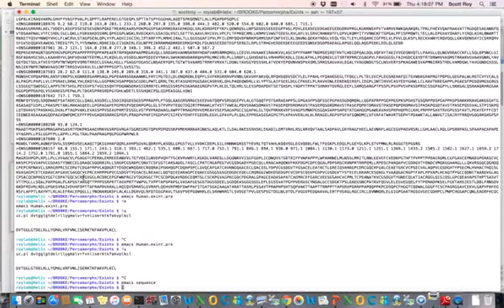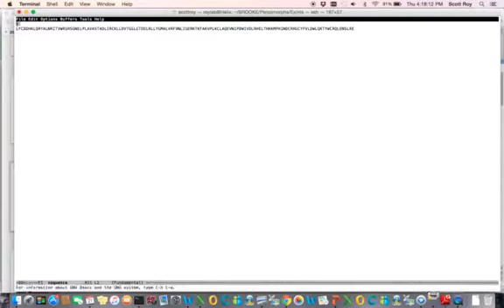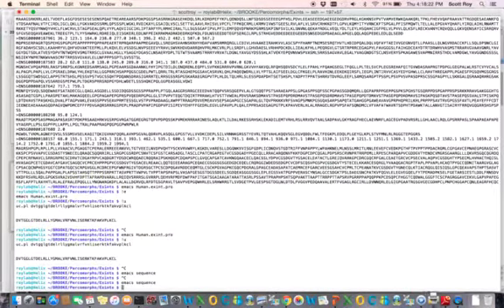So we're just going to have a file that has some dummy name and contains the sequence of interest. And again, let's orient ourselves here. Okay, so we're looking for this sequence of interest or something related to it with an intron position at the R. Okay, so now we can take this sequence and just do a blast search of it. In this case, we're going to do a blast search of a protein sequence against the genome. So we actually need to get the genome.